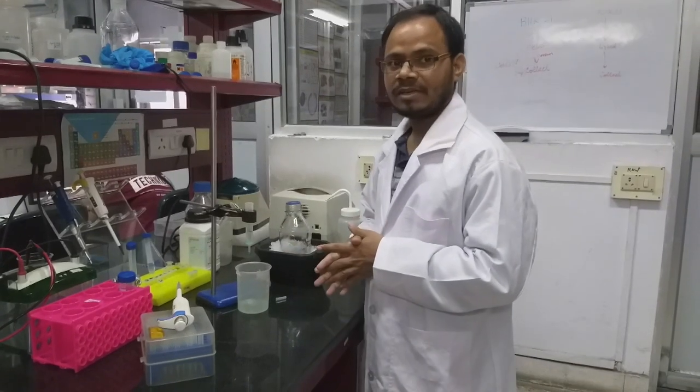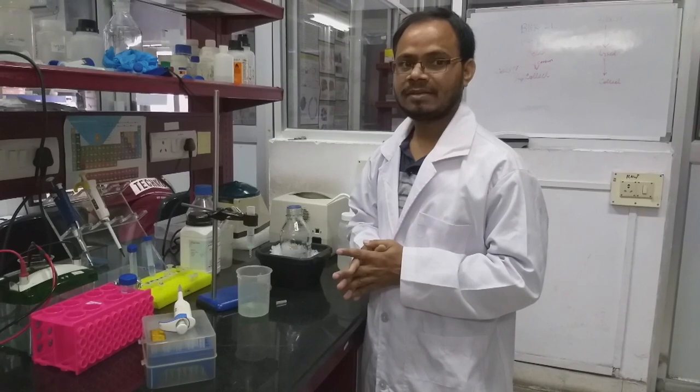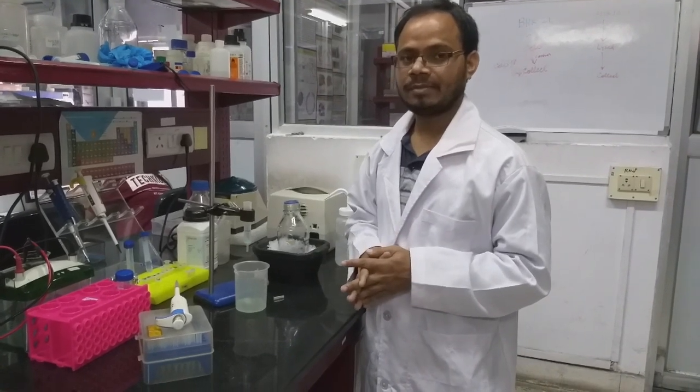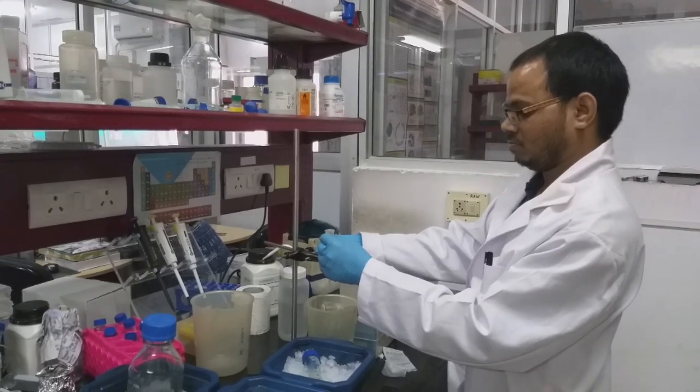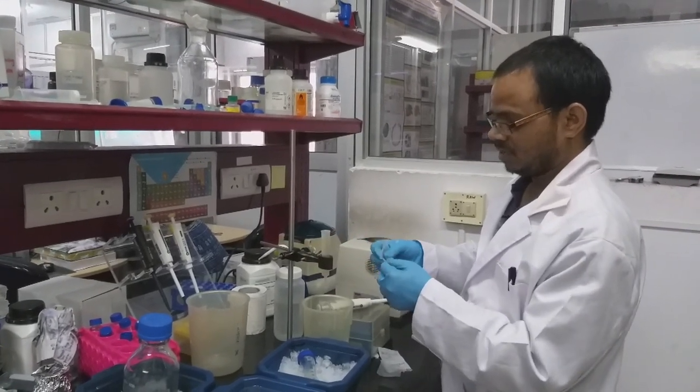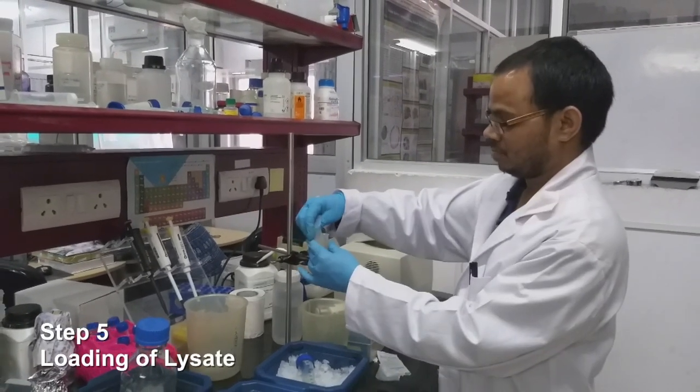So after equilibration, next step we will load the lysate and then incubate for binding. This is a paraffin film. I am going to close this, making the pan.